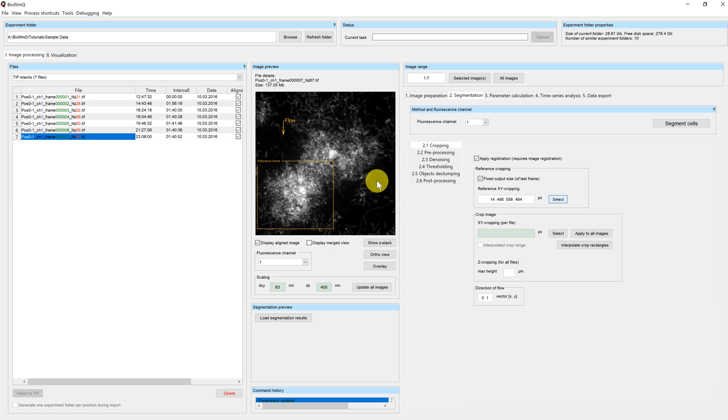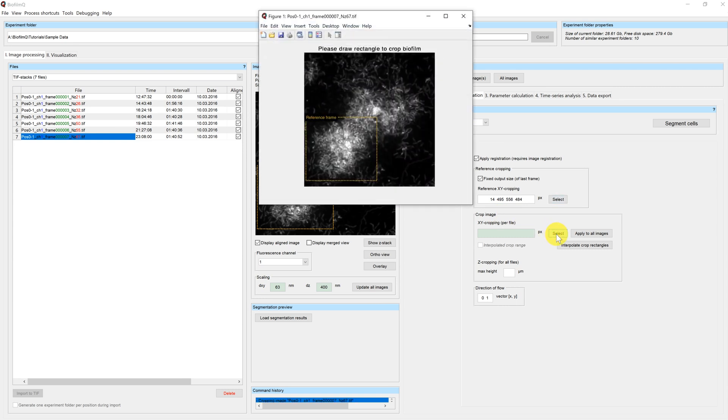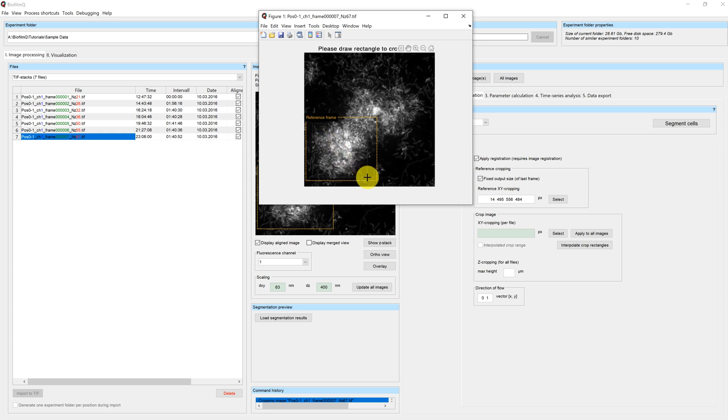Inside this reference frame, you can now select your region of interest. We again click on select and you can select the biofilm you're interested in.